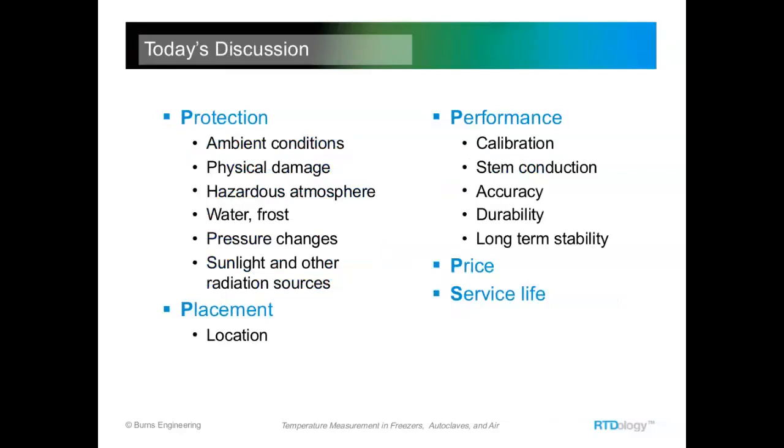This is the format we're going to follow. We're going to go through how the probes need to be protected, where we place them in the process to get the best performance, and talk a little bit about calibration and interchangeability of the probe, some of the same things we've done in other webinars when we talk about the performance of the probe. And then finally we'll finish up with the price and the service life for the probe.